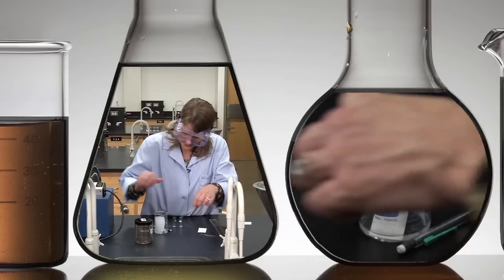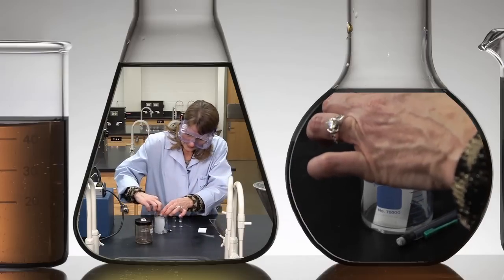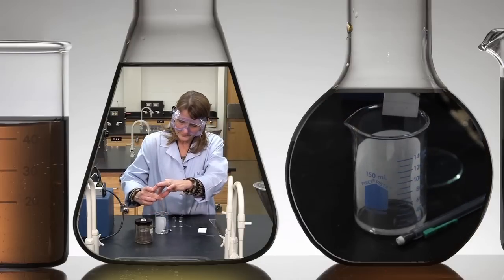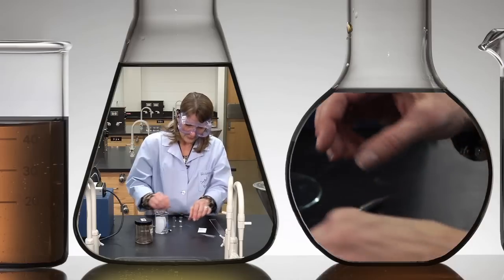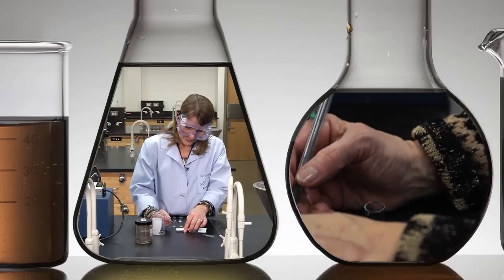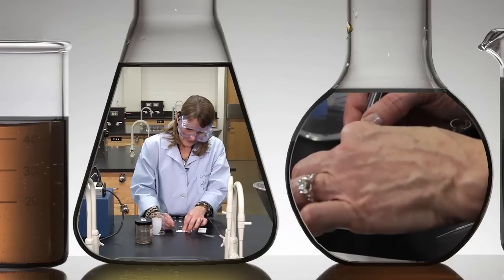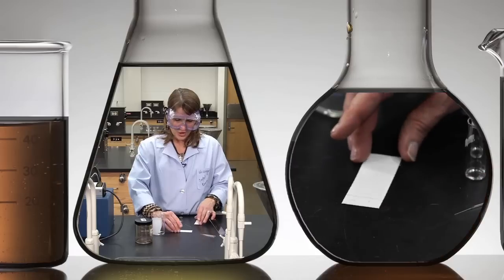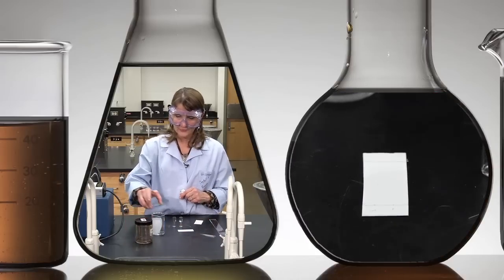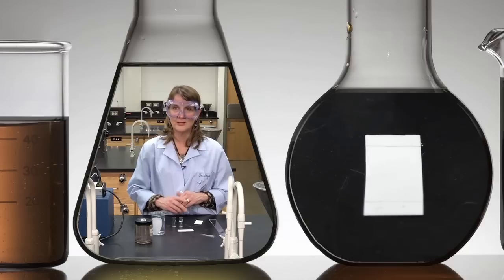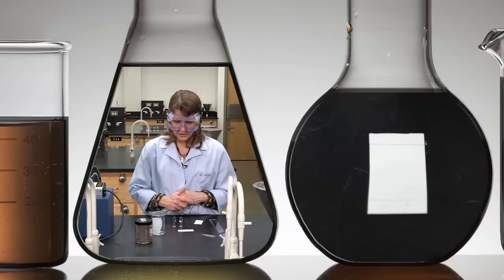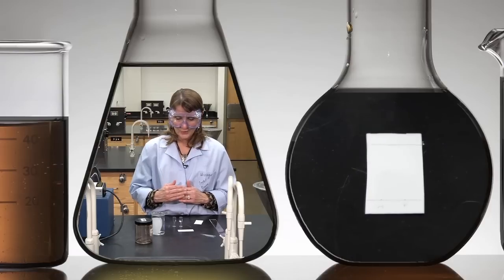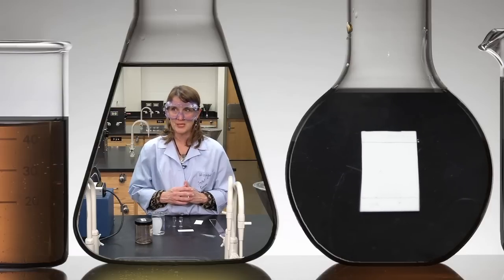You can still see the solvent on it and before the solvent evaporates, you want to mark the solvent front, which is how high the solvent went on the plate. This will be very important for calculating the RF values, which is the ratio between the distance each spot moved from the baseline versus how far the solvent moved from the baseline.